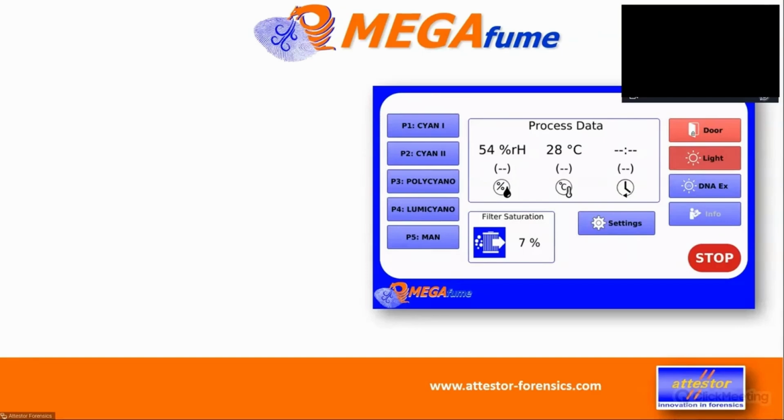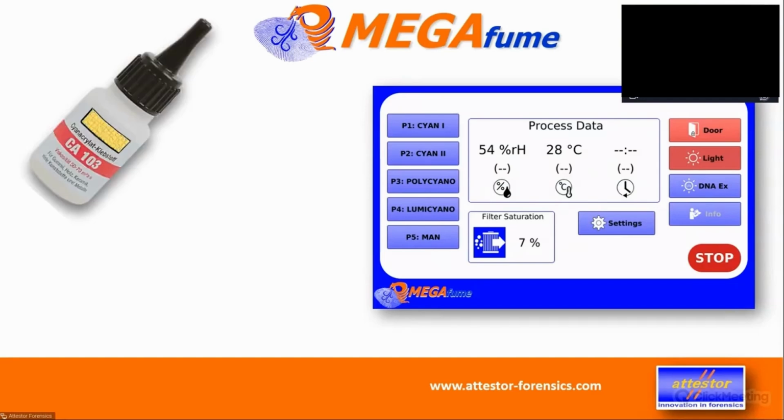And when you come to 95%, I think it gets a bit more dominant and says, you better look now for a replacement, I'm due soon. And then once you are at 100%, the system completely blocks the usage. You can't use it anymore with a saturated filter before you replace the filter. Right, that's about the filter saturation.